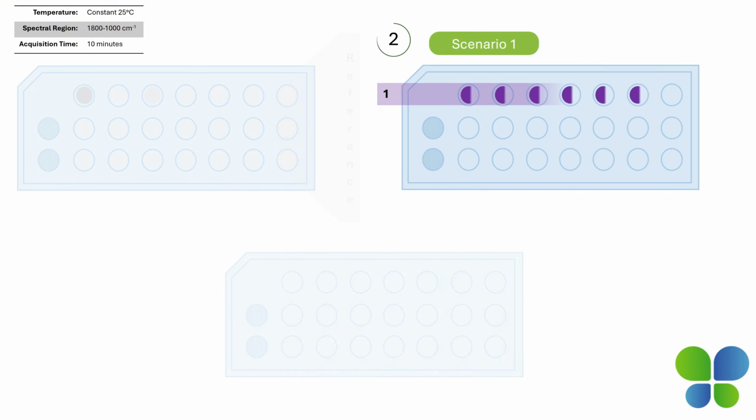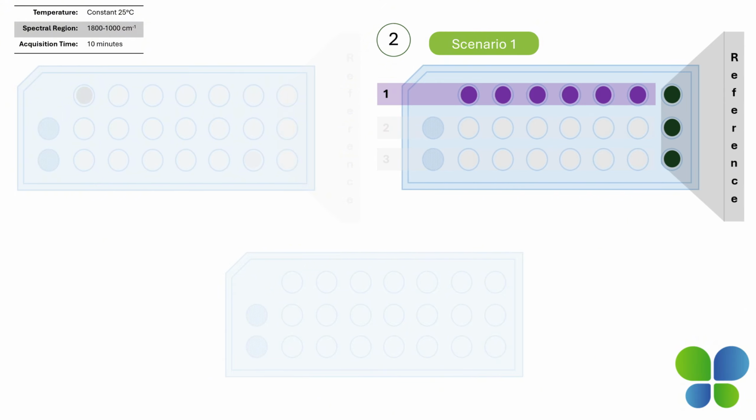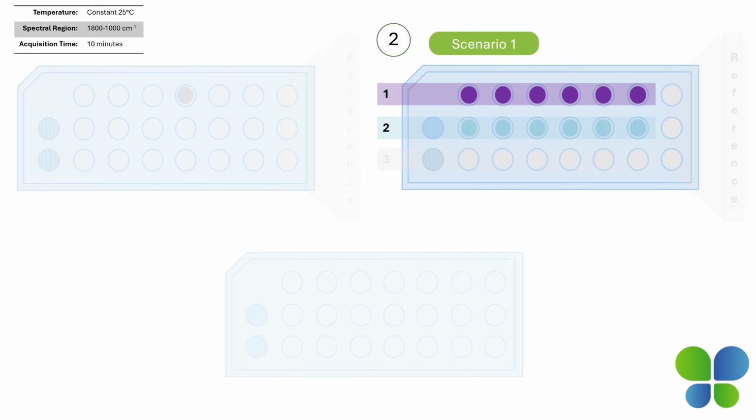A first scenario involves formulation optimization, where various formulation parameters are evaluated to ensure physicochemical stability under varying formulation conditions based on their drug delivery. This is especially true for subcutaneous delivery, for which high concentration and high dosing conditions are required, and the concern for self-association or aggregation risk at high concentration needs to be addressed.